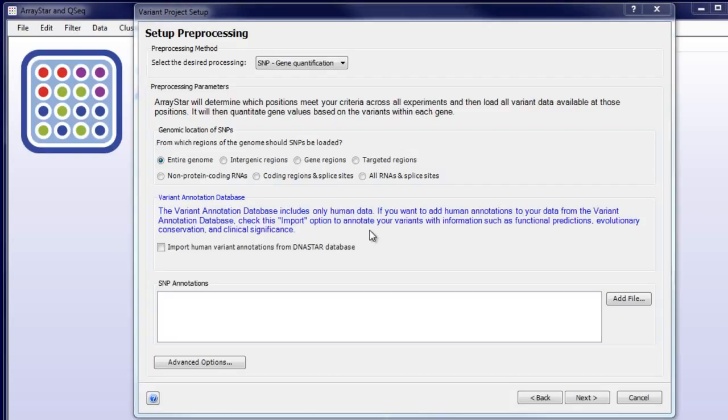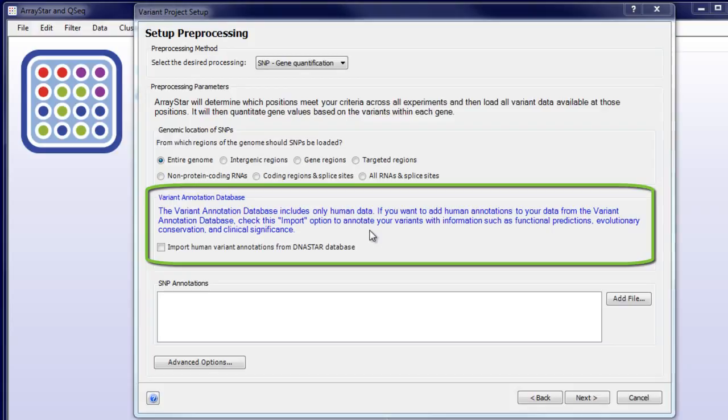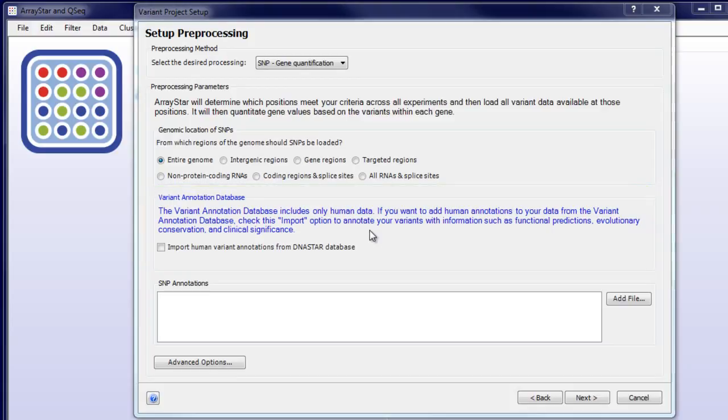Then, we'll choose to load SNPs from the entire genome, and if you're working with human data, you can also import annotations from the DNA Star Variant Annotation Database. In this case, since we're working with bacterial genomes, we'll leave this unchecked.